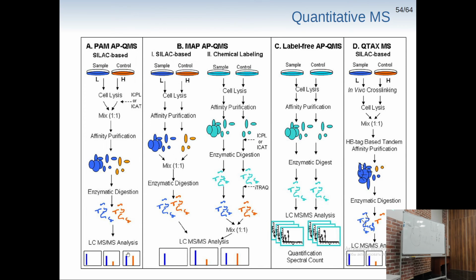get those differences in mass. So the same peptide will elute at the same time, have the same properties, but on a mass spectrometer we have different peaks. For instance, we can label arginine to have a difference of 6 Dalton. So they will be clearly visible on our mass spectrum, and we can get the differences between those peptides. The ionization for these peptides would be the same, so the difference in the number of ions would be only because of the difference of concentration in the sample, right?